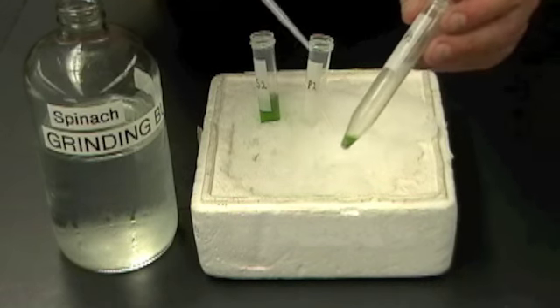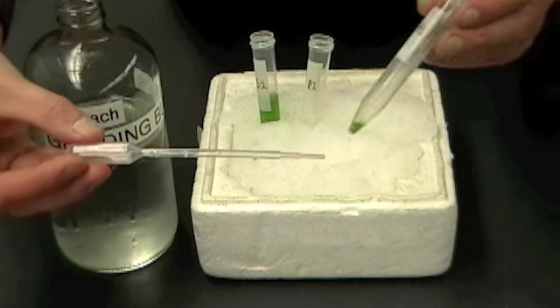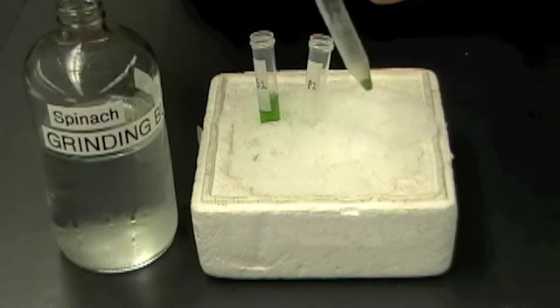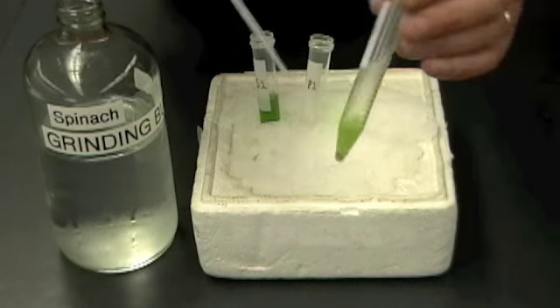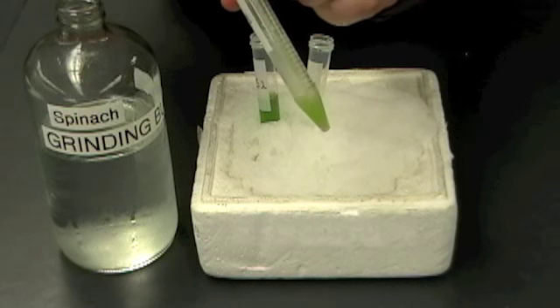So you're going to need to mix this with 1.5 mLs of this grinding buffer. So you can just use these pipetters. They're marked here with the amounts of milliliters on there. So I'm going to put 1.5 mLs of that in there. Now the pellet still needs to get broken up, so what I'm going to do now is reach in here and just kind of squish it up and down.